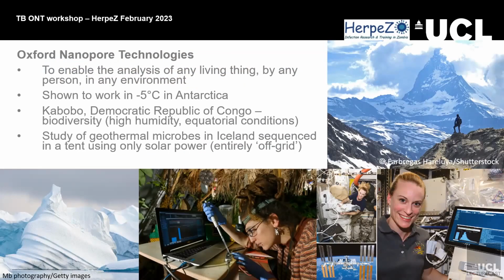That's why if you've ever done Illumina sequencing, you'll always get a read 1 and a read 2, because you get the paired end reading, so you get both the forward and the reverse strand. With Nanopore, it's different. You only get one single strand currently.